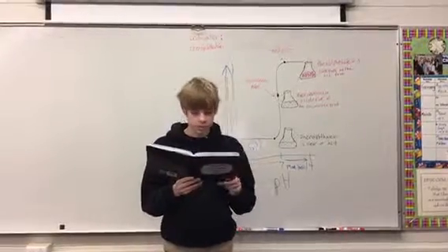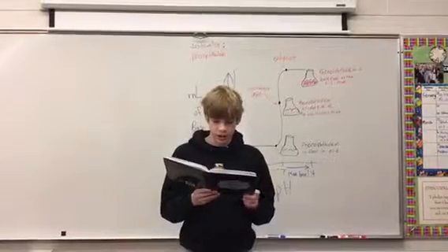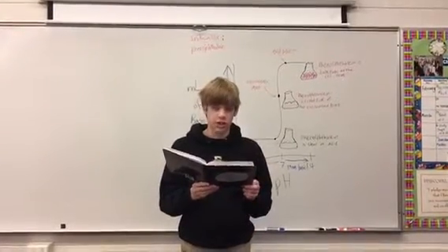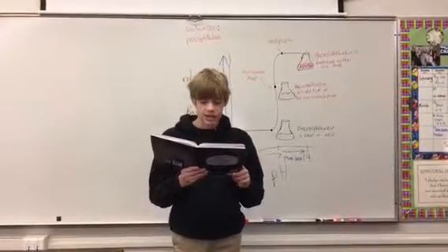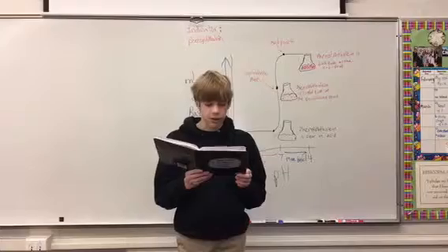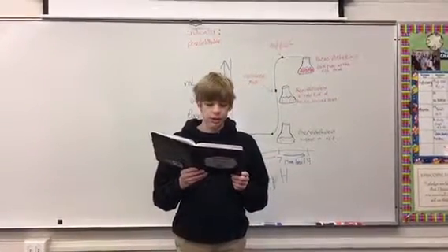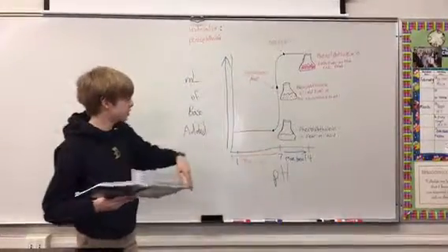In a titration, successive additions of an aqueous base, whose concentration is known, are made to a measured volume of an aqueous acid, whose concentration is unknown. As the base is added, the pH changes from a lower numerical value to a higher one, occurring slowly at first, then rapidly through the equivalence point, and slowly again, as the graph here shows.